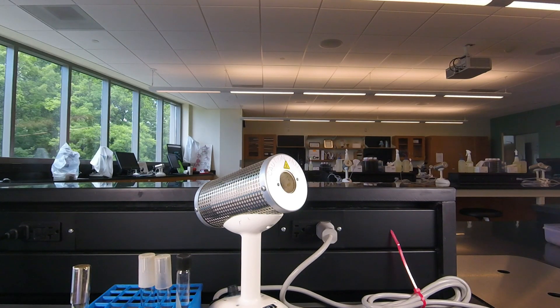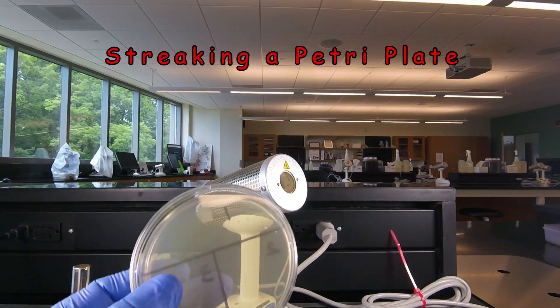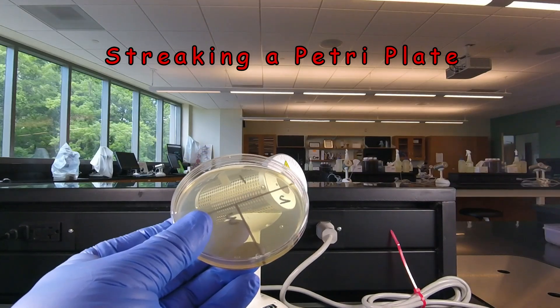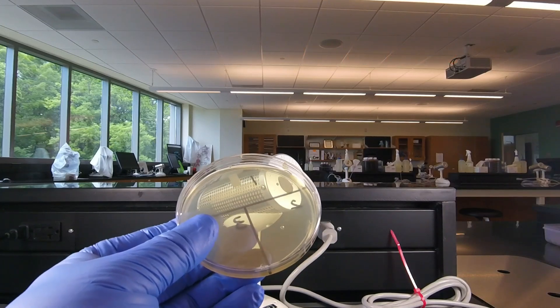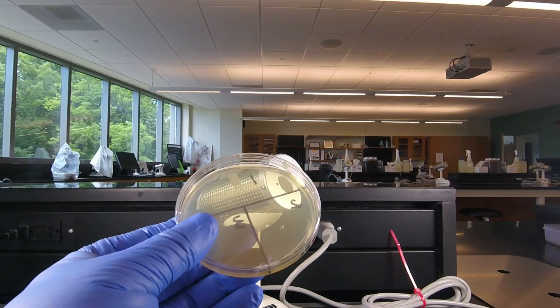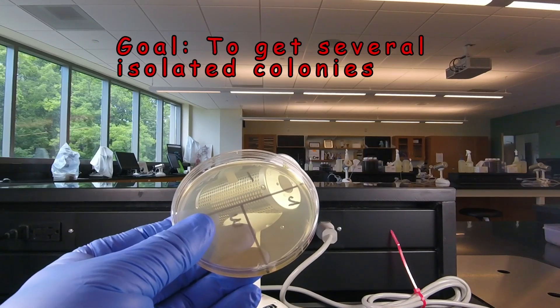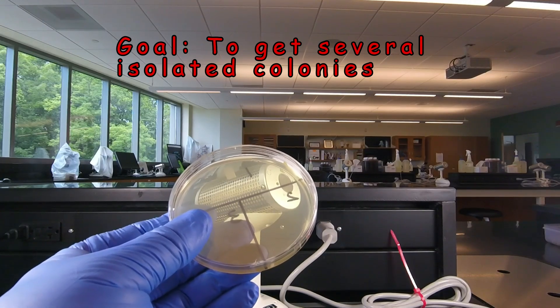In this video lesson we're going to learn how to streak a petri plate. Normally when we streak a petri plate, we want to streak it in such a way that eventually we see single isolated colonies somewhere on the plate. And since there are hundreds of millions of bacteria on the inoculating loop to begin with, it takes a lot of spreading and re-spreading to separate the bacteria to get single colonies. But this is an essential technique we need to master.